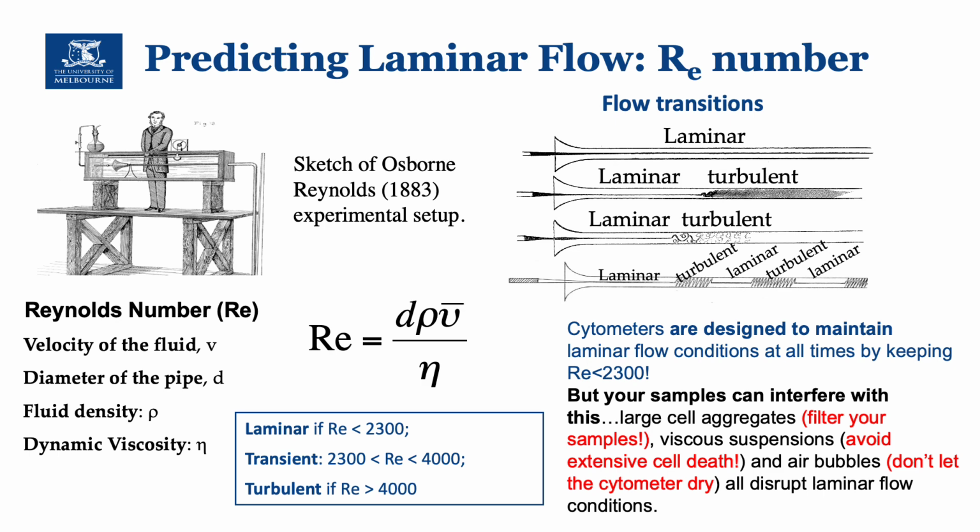The quality of your sample is super important, and it's something you always need to keep in mind. Filter your cells, always. As long as you can see any kind of aggregates or suspended particles that are bigger and visible to the bare eye, well, this sample needs to be filtered. Otherwise, you will get things like blockage, turbulence, and imprecise measurements.